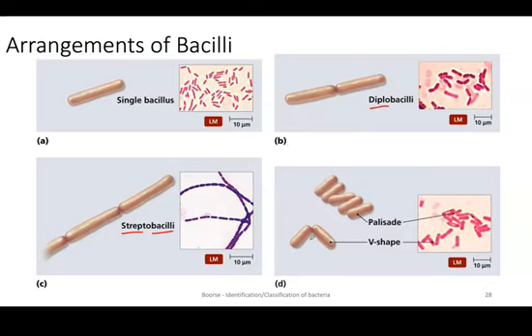Moving through this lecture is really about understanding how we can name and identify bacteria. Part of that is using microscopy to visualize bacteria. To be able to see bacteria under the microscope, we have to make bacterial smears, which is putting them onto a slide, and then stain them either using a simple stain, or often a differential stain like a Gram stain.